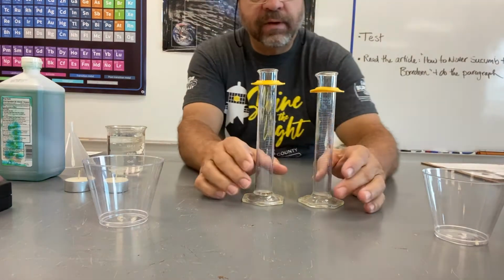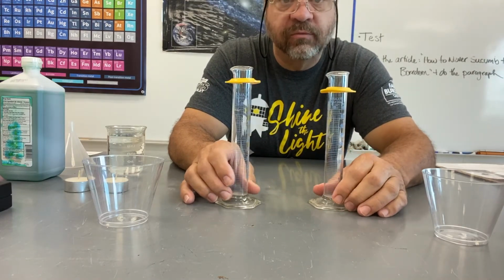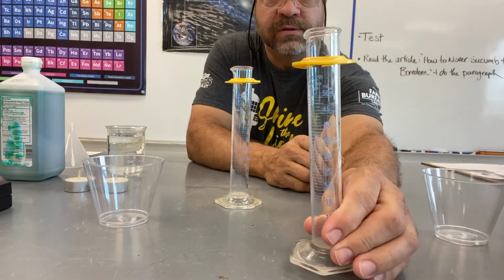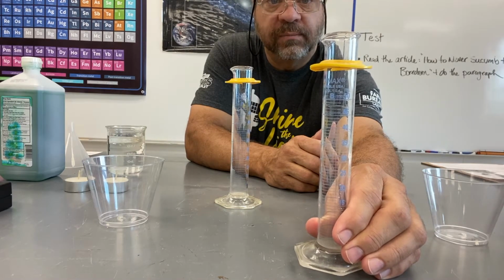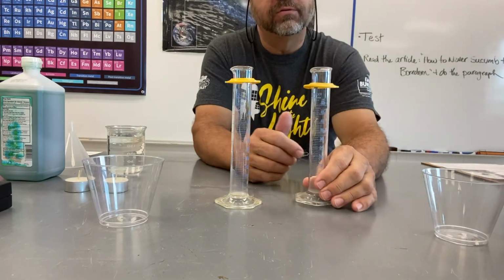So first off, I've got some tools here. These are graduated cylinders, if you haven't run into these before. It's a cylinder shape. The graduated part means that there's a scale on here where it is marked out in milliliters. This is a relatively small graduated cylinder. It goes up to 50 milliliters, which is exactly the amount that we're going to be using for this lab.